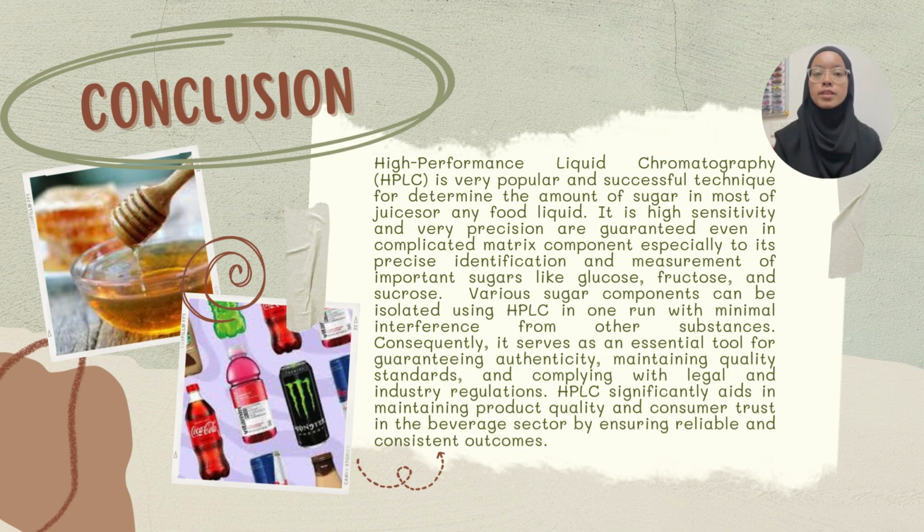As a result, HPLC serves as an essential tool for ensuring product authenticity, maintaining high-quality standards, and complying with both legal and industry regulations in the beverage sector.